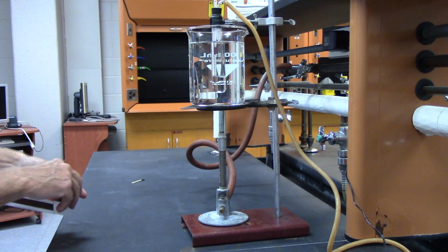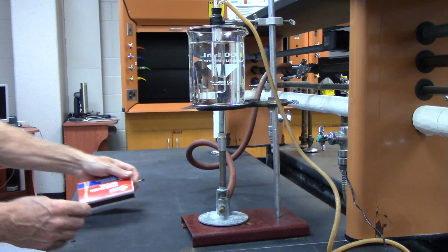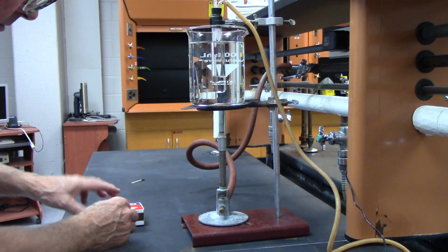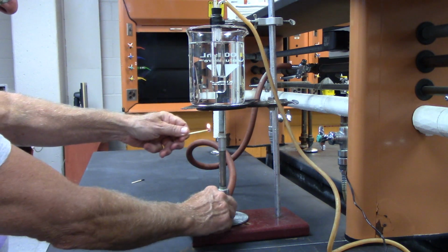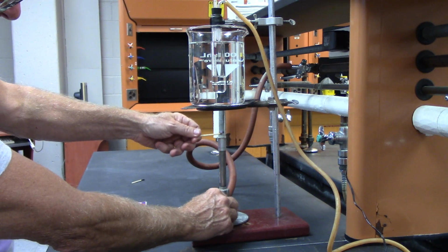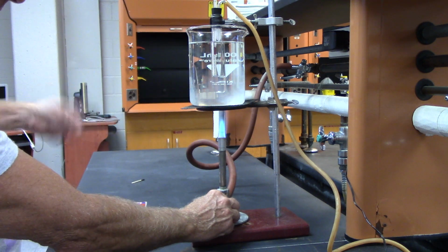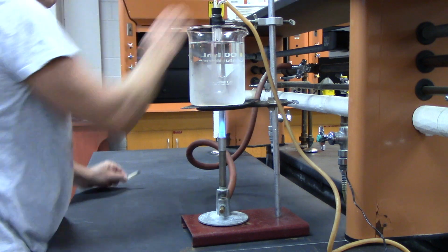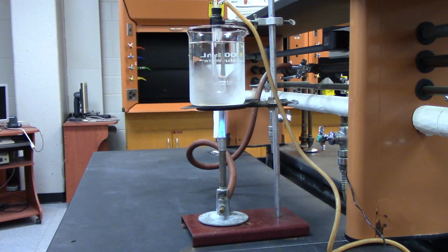Same idea. I turn on the source, and there's air coming in, and there you go. I'm just going to let this go until it gets near boiling, and then I'll have a short video showing what happens at the end.